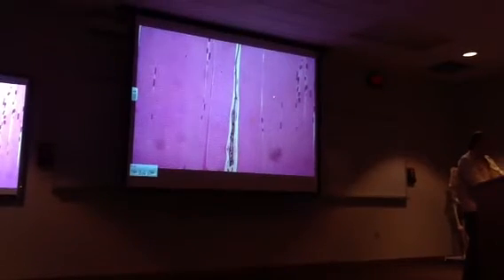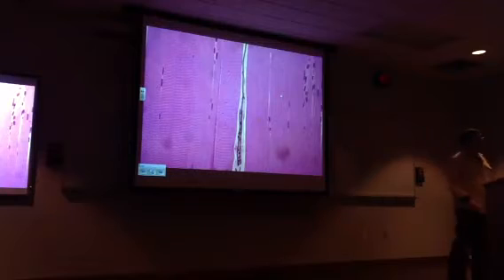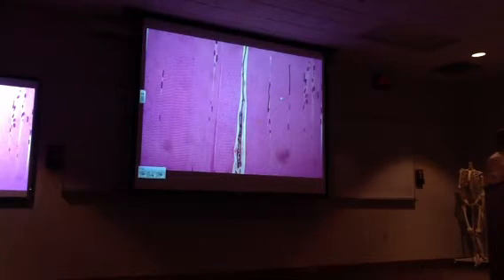Epimysium is just not on the slide. There's no way to know where epimysium is. Something like this between individual fibers is probably endomysium.